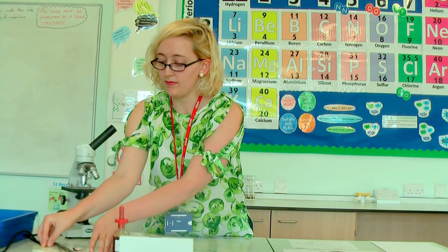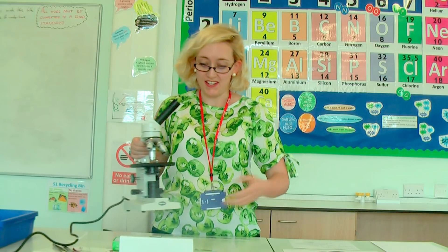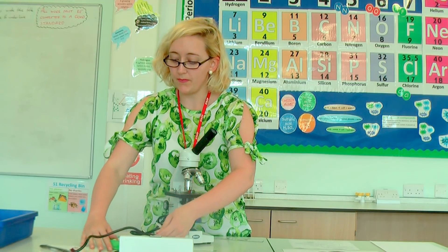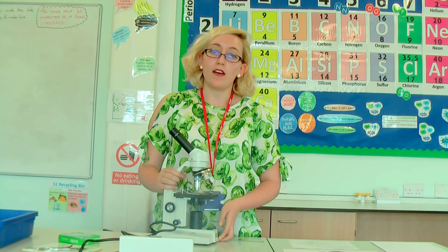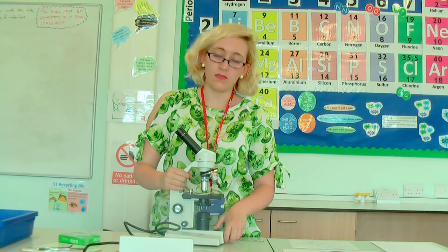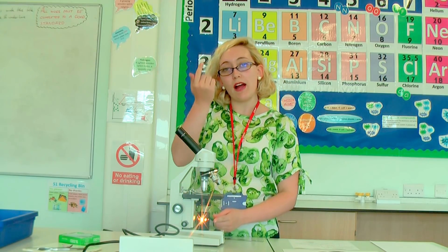The microscope you're using might look slightly different from mine. They all have the same basic parts with a few variations, but I'll show you mine and we'll have a look at what the bits are called. This microscope has got a light at the bottom — a few of them have got mirrors at the bottom. The point of the light at the bottom is to shine it through our samples so that we can have a look at it.